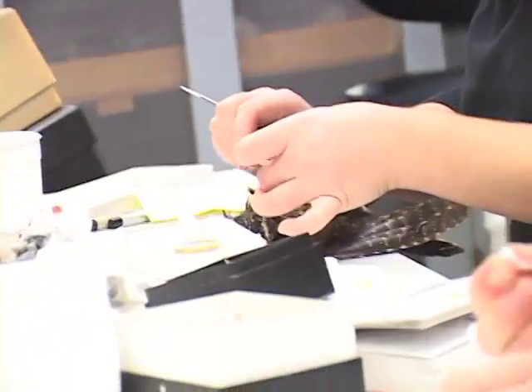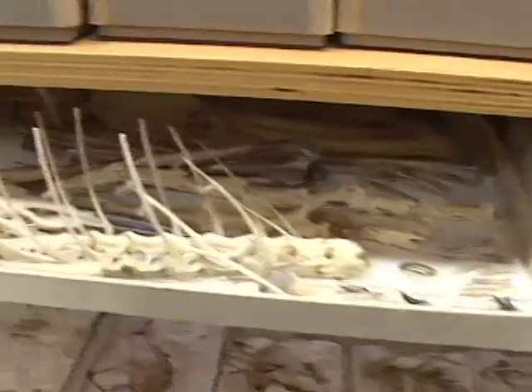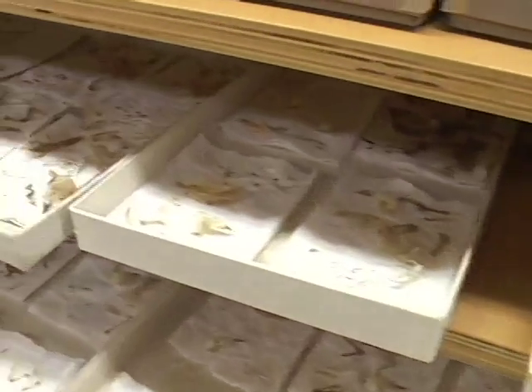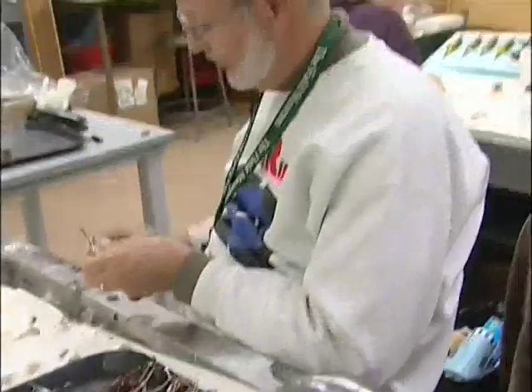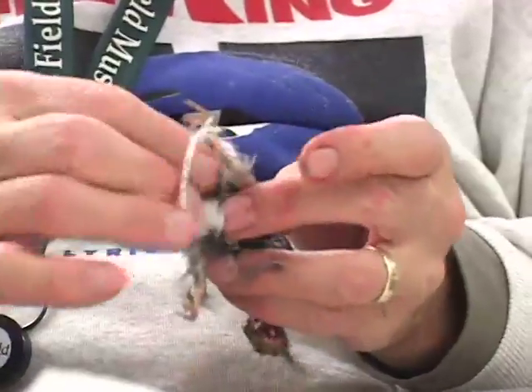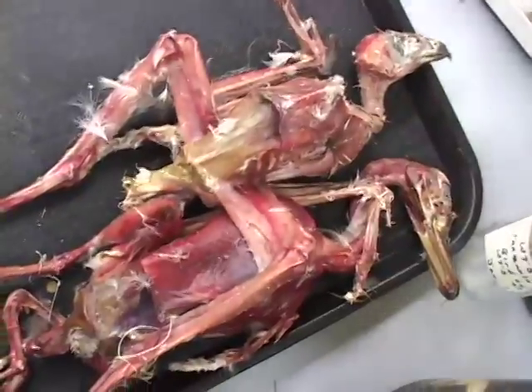Among the different kinds of studies that are done in a museum like this are studies of relationships between different species and different families of birds, and often the shape of a bone may say more about that than one would be able to say just by looking at the bird on the outside. So some of the folks out there are getting birds ready to be made into skeletons, and so they're doing a very crude process of just essentially pulling skin and feathers off and leaving the carcass of the bird, which will then ultimately come into this room and be made into a skeleton.